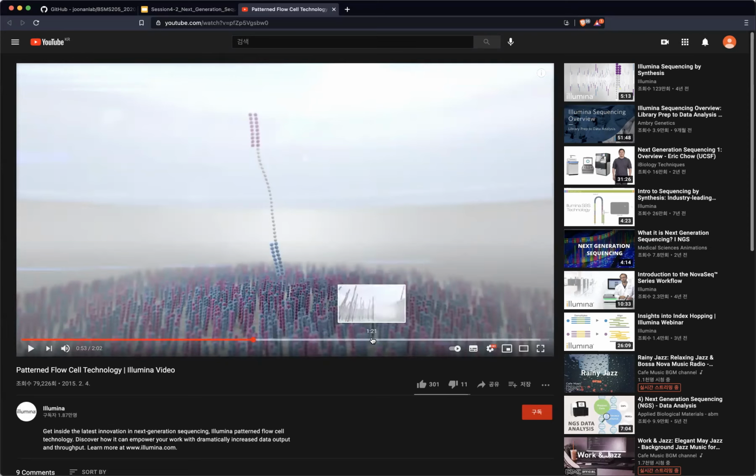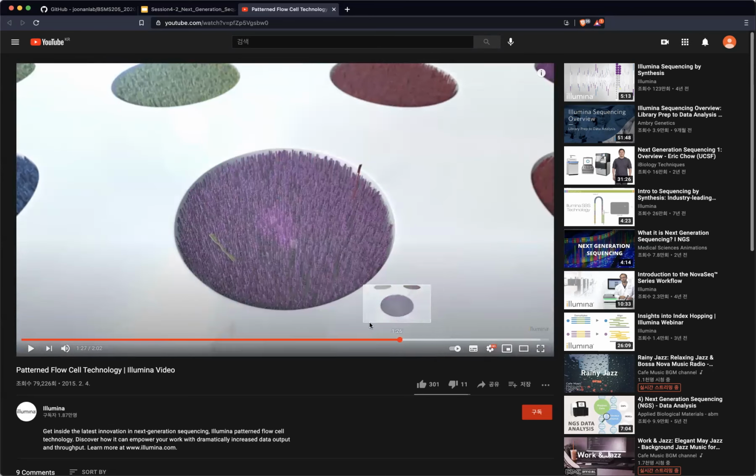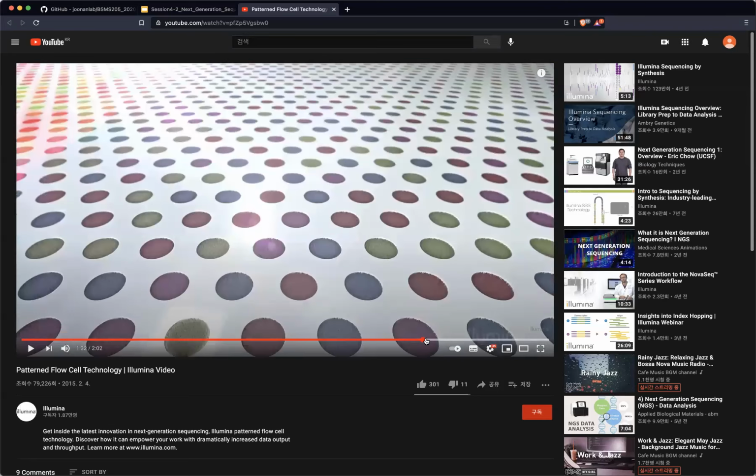Why that is important is that once you get the sequencing, you will see, okay, this area is all composed of purple color, and here is the red, here is blue, and here is green. The reason is that the one DNA library put in here will bind to all of the area and occupy the entire arena of this space, right? And that happens to the other positions as well.